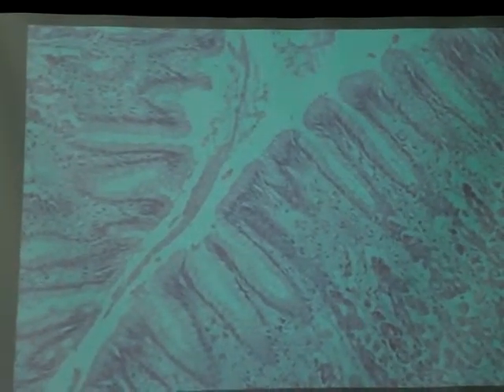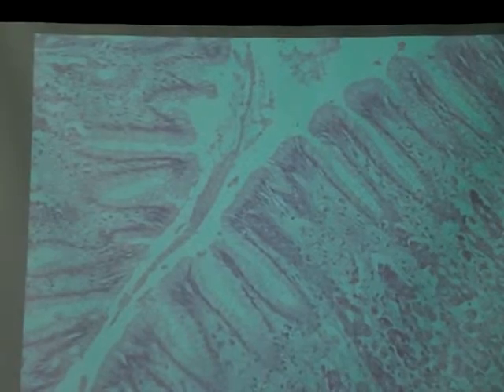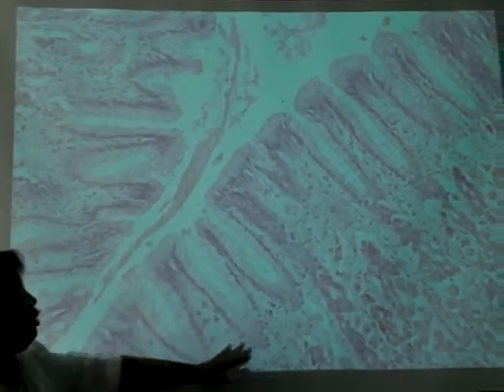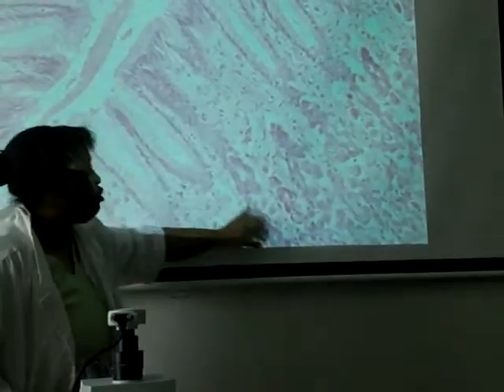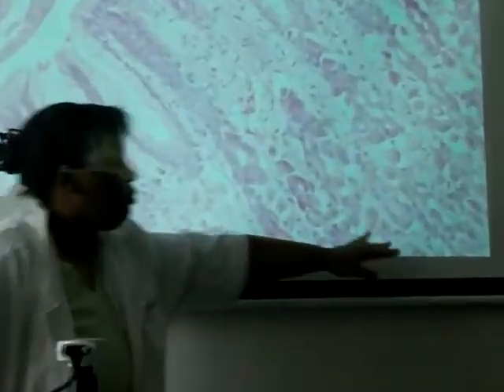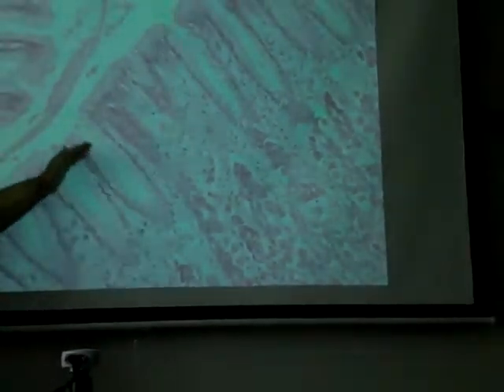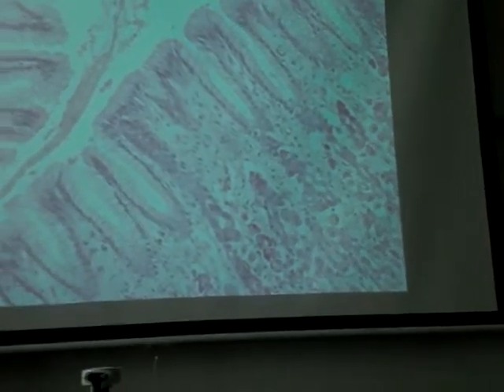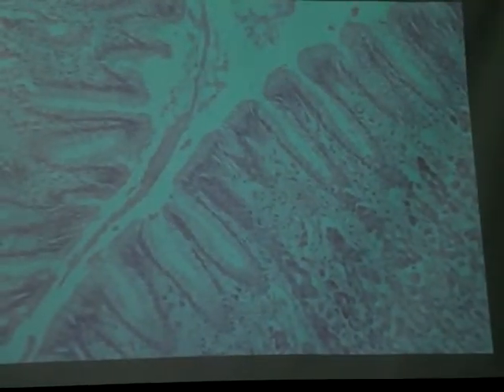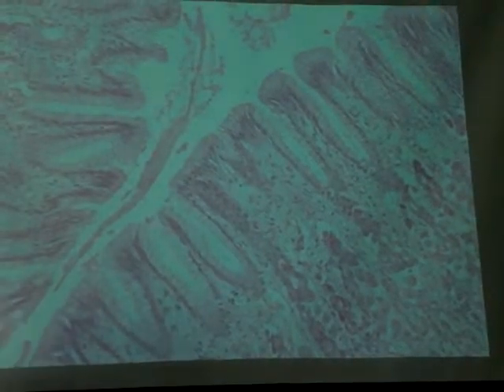Lamina propria actually is going to connect to the connective tissue layer below. And when you get into this area, you notice that the tissue type has changed. That is submucosa. So your lamina propria here flows right into the submucosal layer here. So from here up is mucosa, from here down, submucosa. Now let's look at the muscularis and the serosa.